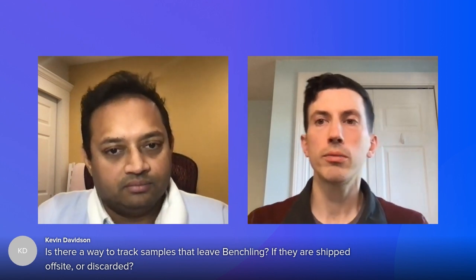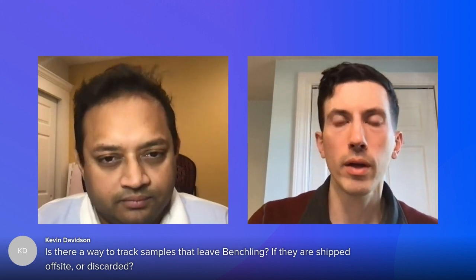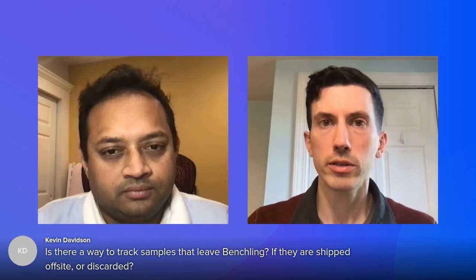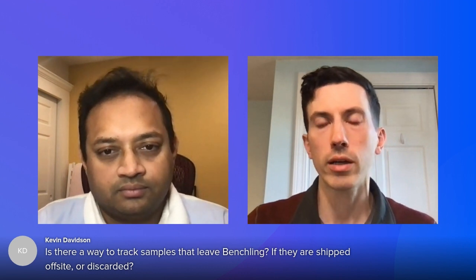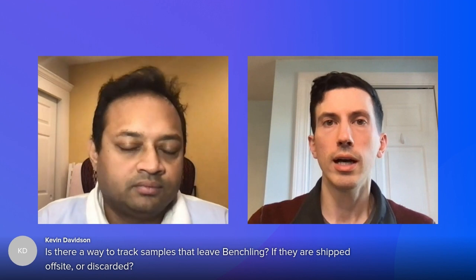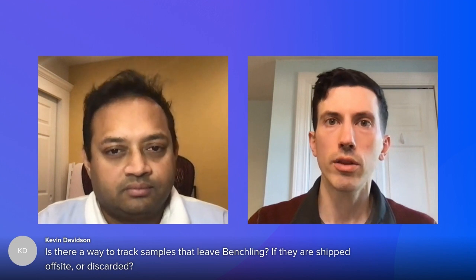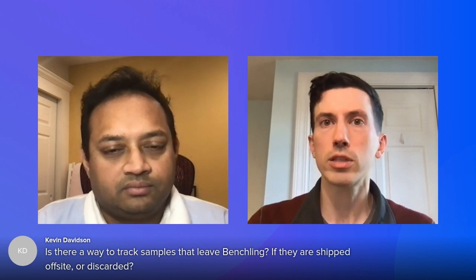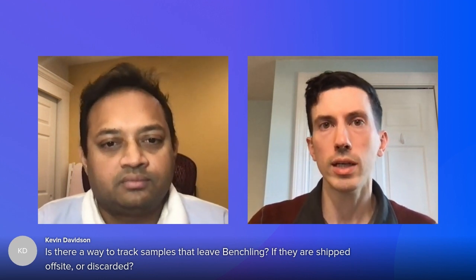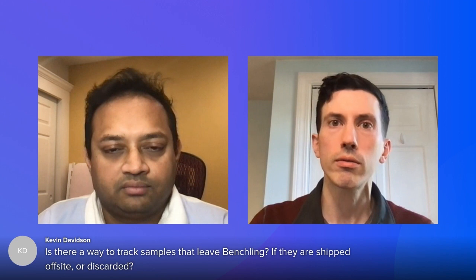Yeah. So in terms of shipping, if you have a deliverable that you actually want to ship, a common use case is to input, say, tracking information associated with that shipment, so you can have a record of that action. And then if you're removing things from the database, you can also utilize the archiving functionality when you're talking about containers, and you can archive because things are expended or shipped, or you can indicate those sorts of reasons for archival, instead of just made an error. Yeah. Got it. Thank you, Tom.